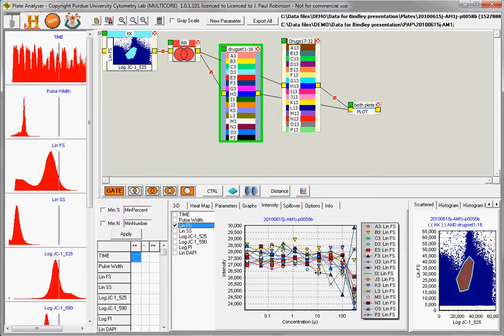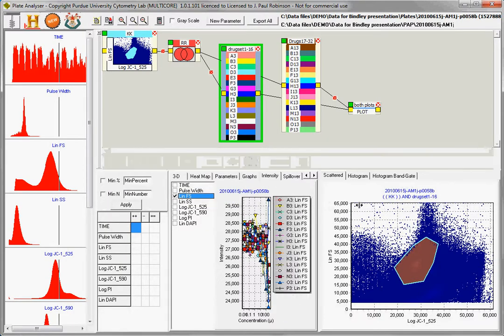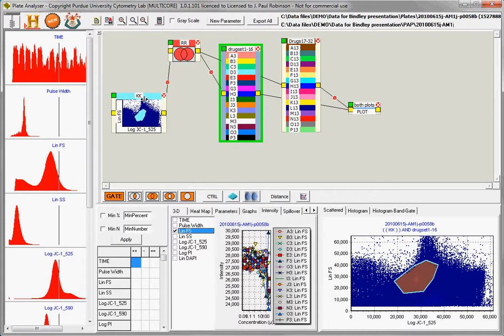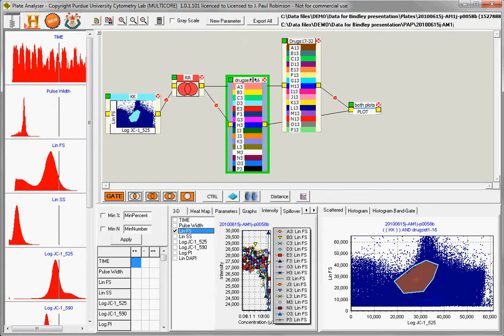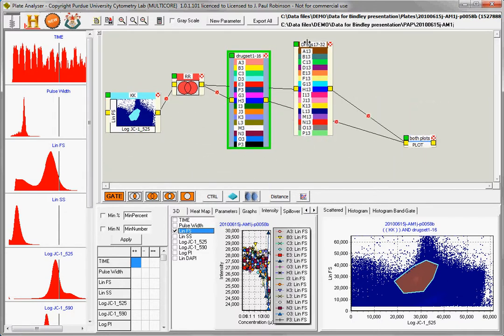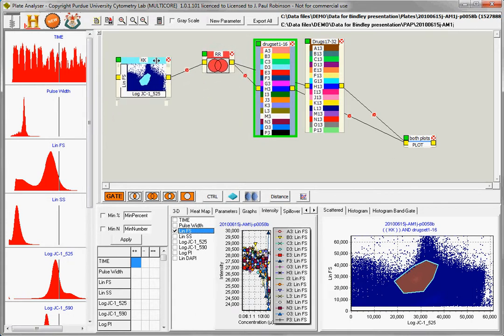And you did notice that I moved this gate, and I can move these gates. If you grab hold of this gate on this double line here, you can move the entire top area here to a second screen, and gives you a full screen for your logic tree. When you have a very complicated logic tree, that's very useful. Of course, you can move things around. Everything's on elastic strings, and you can move them in pretty much anywhere you want, and make your logic tree very logical. And you can name things, and you should name things.